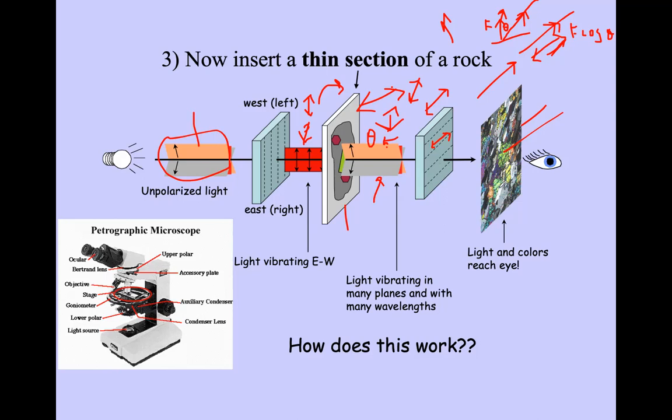The light reaching your eye will have a vivid color spectrum, because only some component passes through the second polarizer, not the entire beam which is available here. If you could see this entire beam coming out, then you would see the natural colors again, but that never happens because the vibration direction is this way.